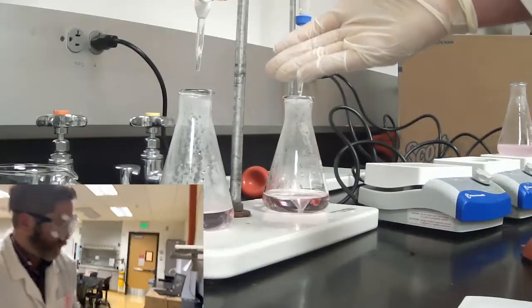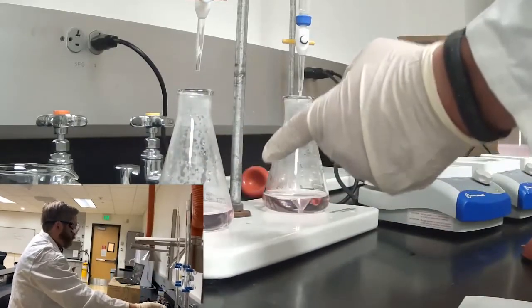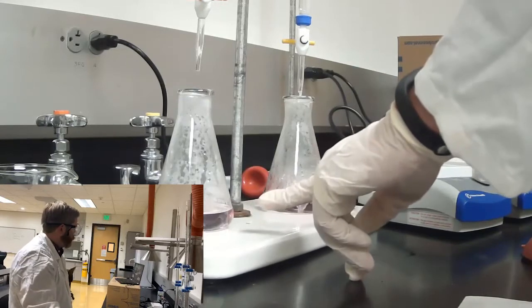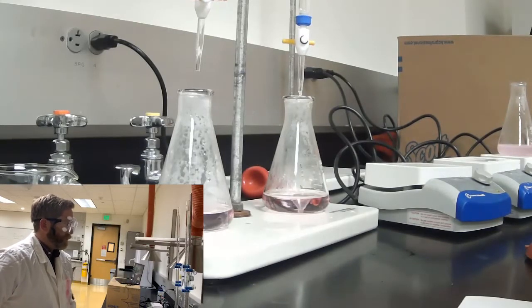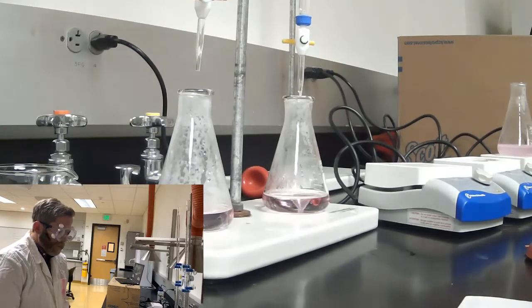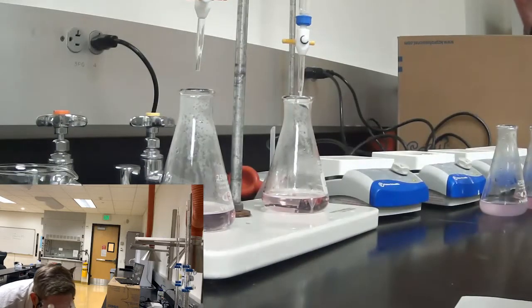Burettes are designed in order to measure how much has been dispensed. So we're going to have a starting value and then a final value, and the final volume minus the initial volume will be the amount of titrant that it took in order to neutralize the acid in our Erlenmeyer flask. So by subtracting those two numbers, we know the volume of sodium hydroxide that it took. So we're going to keep boiling these until we have driven all the carbon dioxide off. And then once we are finished with that, we will proceed to the titrations.